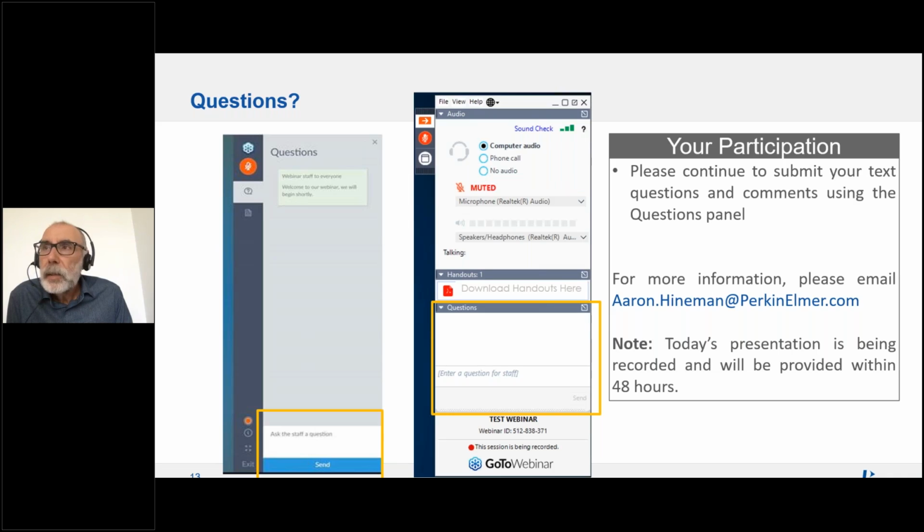Okay, thank you. And then which nebulizer did you use with the Aspiron spray chamber? Well, in the paper we have published, we used a prototype. This is a flow focusing prototype developed by a Spanish company. But at the beginning we were working with a standard microconcentric nebulizer without any problem except those that I was talking about at the beginning.